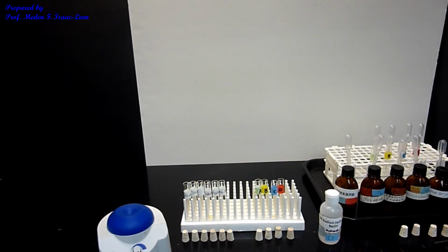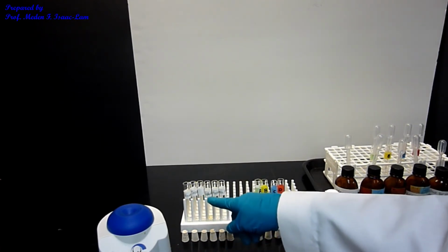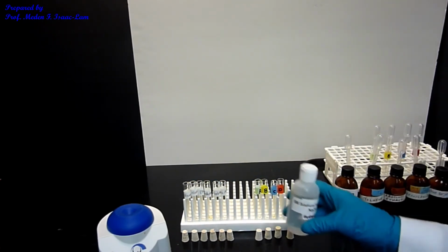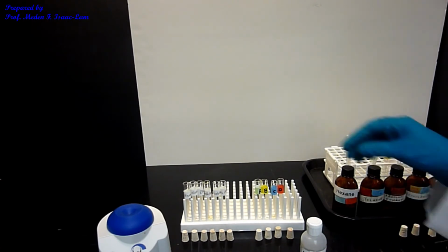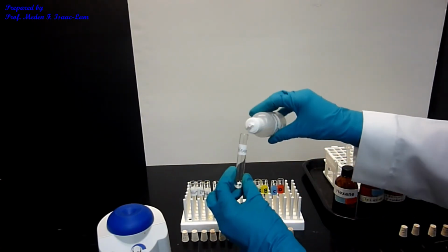sodium hydroxide. So again, I already have all the samples: hexane, toluene, ethanol, diethylamine, acetone, acetic acid, and then A, B, C, D. And then I'm gonna put now sodium hydroxide, 6 molar sodium hydroxide. So write down the observations. Okay, so I'm gonna do hexane. So 8 drops of the base.